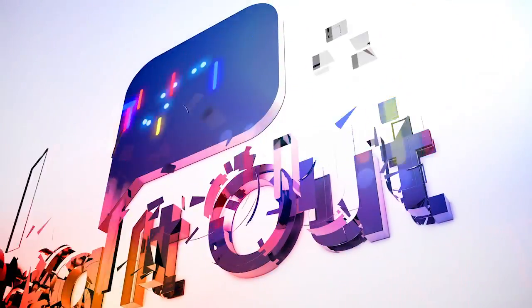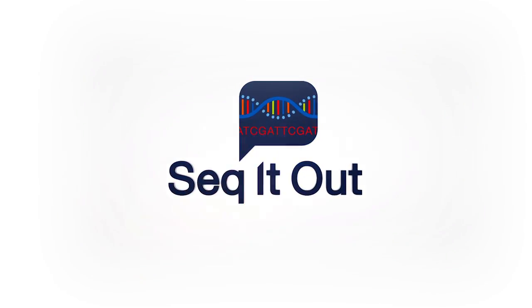Today's topic is the confirmation of next-gen sequencing, or NGS, results using good old Sanger sequencing. You may ask, why on earth would I want to do that? This sounds really backwards. Well, just like a famous saying from an American president, trust, but verify. Did I just say you may want to verify your NGS data?